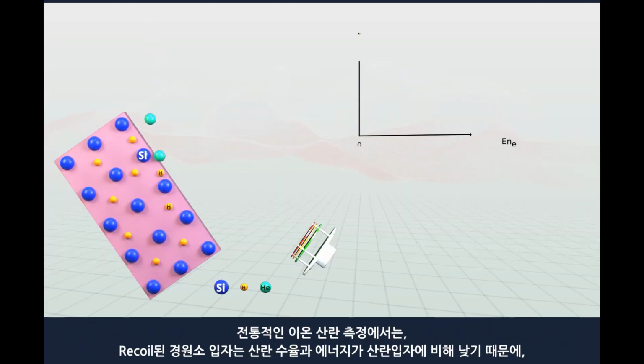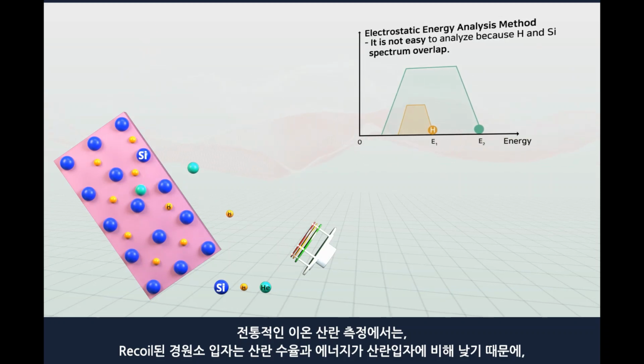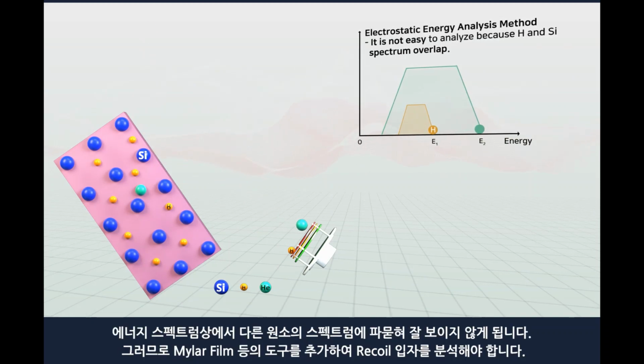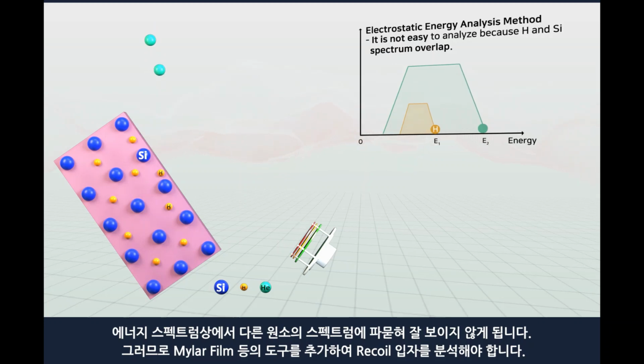The light element recoil particles have a low scattering yield, and their energy is also lower than that of the scattered particles. Hence, they are buried in the other spectrum of the energy spectrum and are not easily visible. Therefore, additional tools, such as a mylar film, should be added to analyze recoil particles.